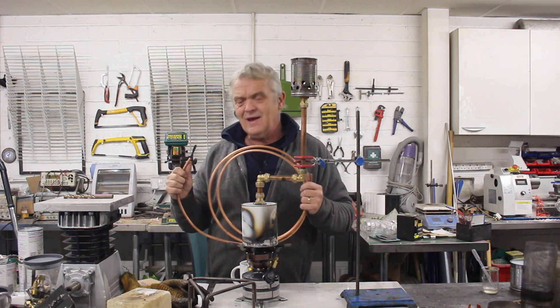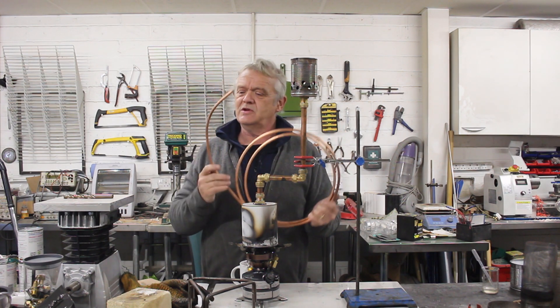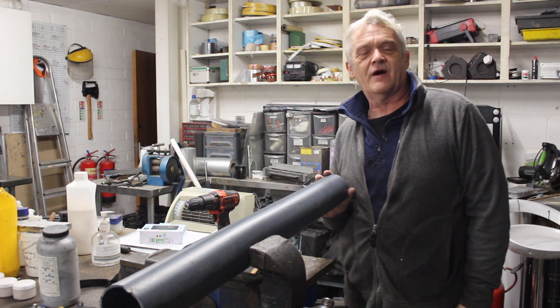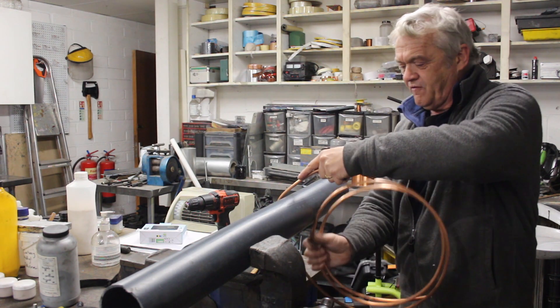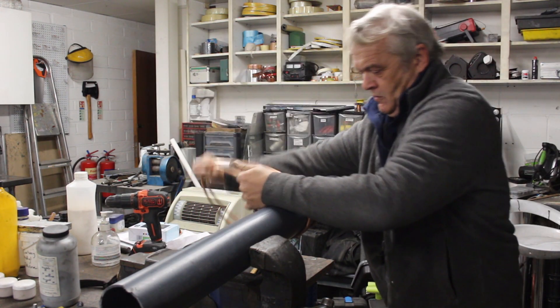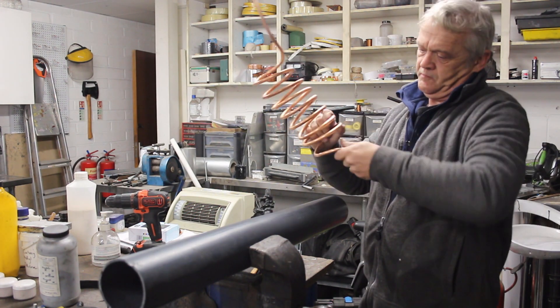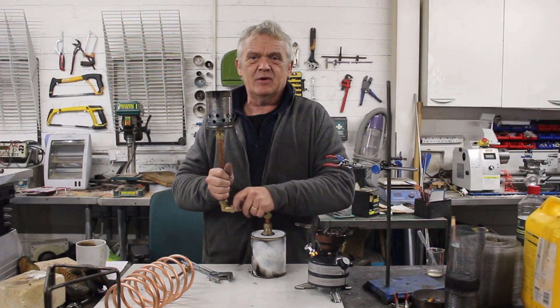To make our coil, I've got this microbore tubing. Microbore is sold for underfloor heating and you can lay it a bit like ordinary cable because it's quite flexible. This stuff is 8mm thick — it comes in 8mm and 10mm. The first thing we need to do is bend a coil, so I've got a suitable former — it's a 75mm diameter piece of plastic pipe — and I'm going to bend my copper around it. There you go, our distillation coil.